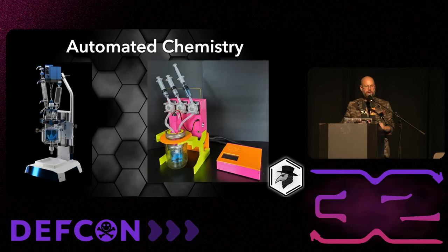So here's our version. Again, you can see it right over here. And if you'll note, they're not that much different because functionally they're doing the same thing. You've got something that stirs. That's that inner chamber, also with a blue fluid. There's a little Teflon paddle that spins. You've got an outer jar. Both of these are just mason jars.